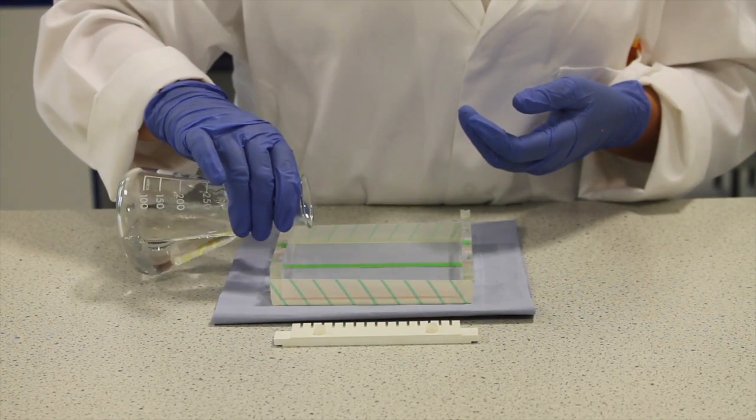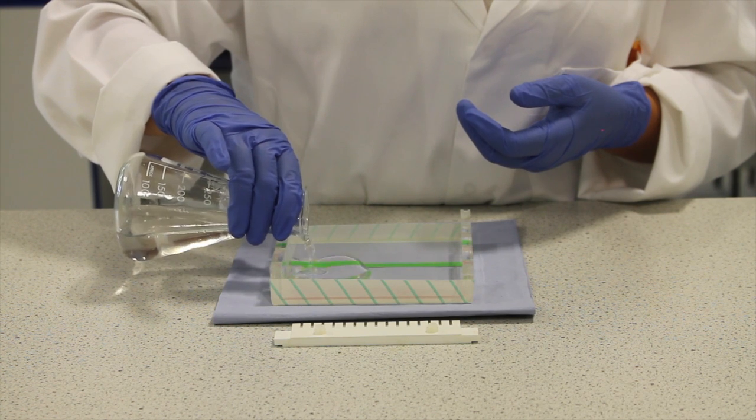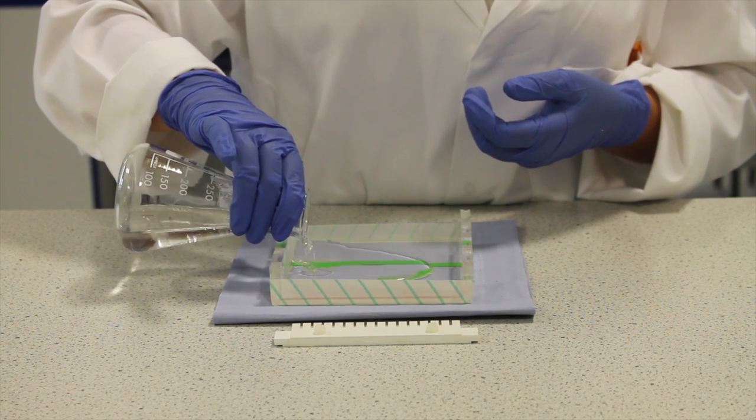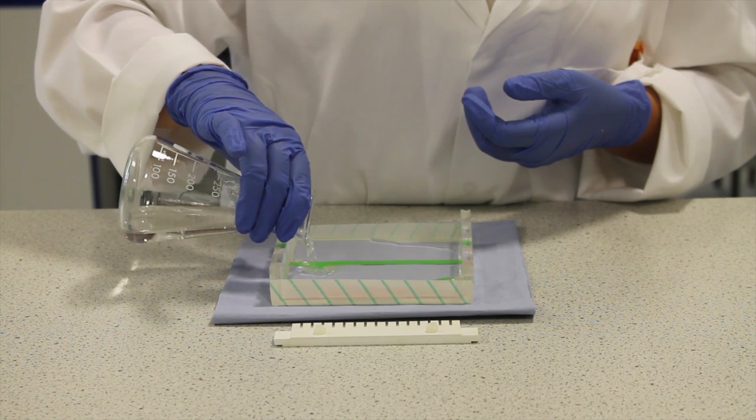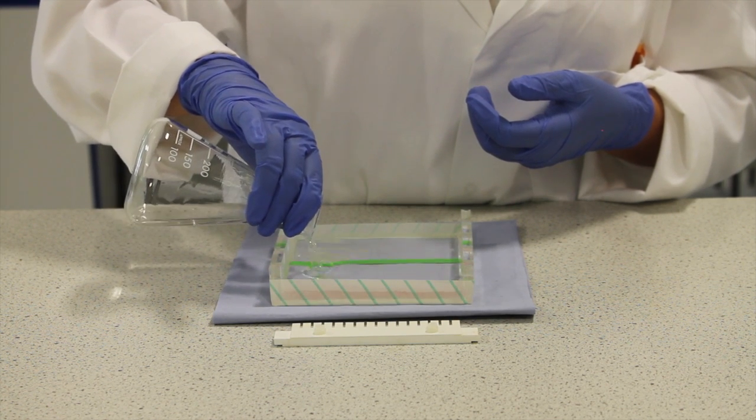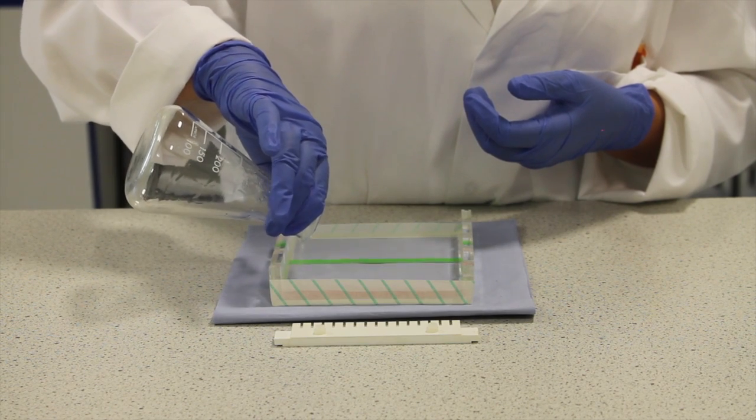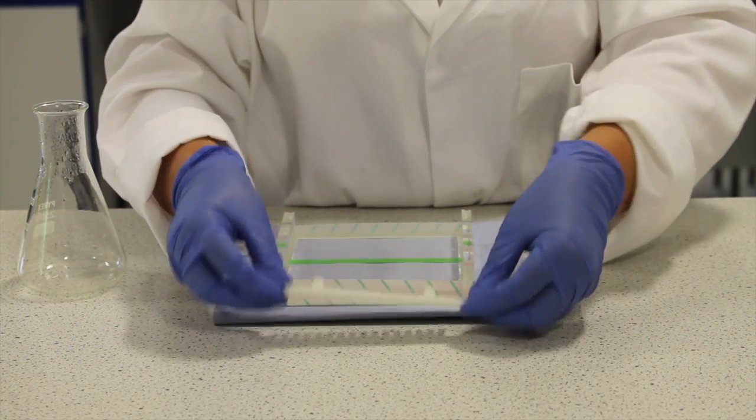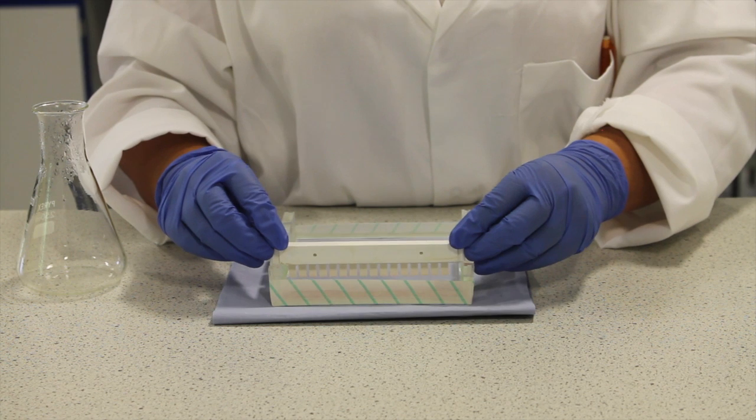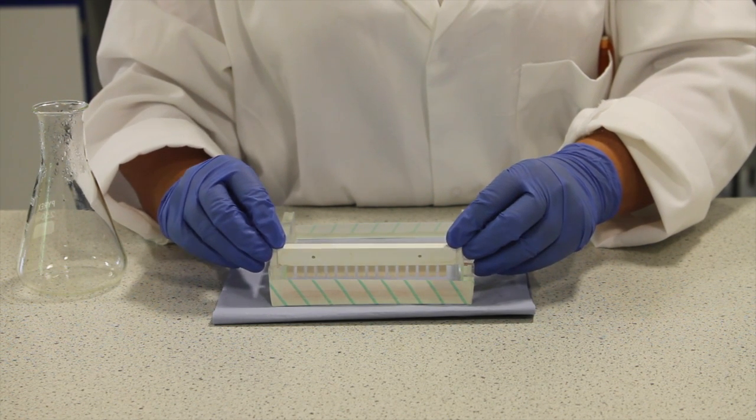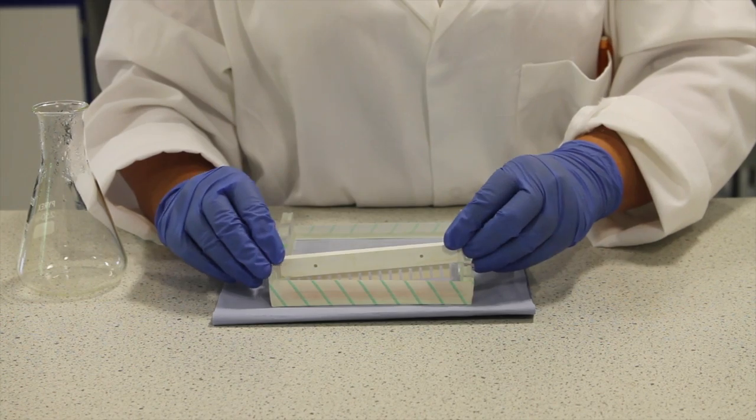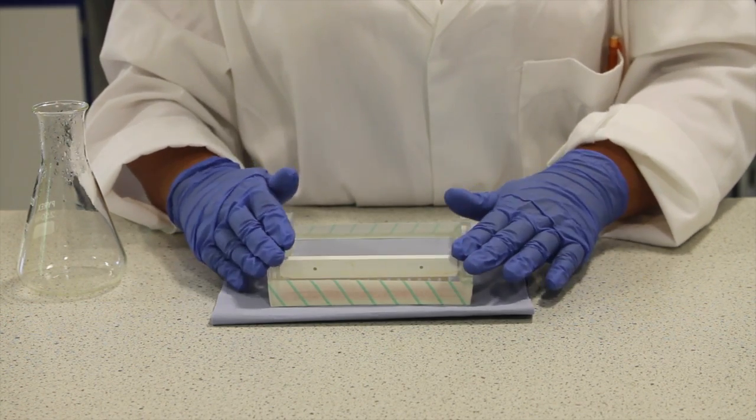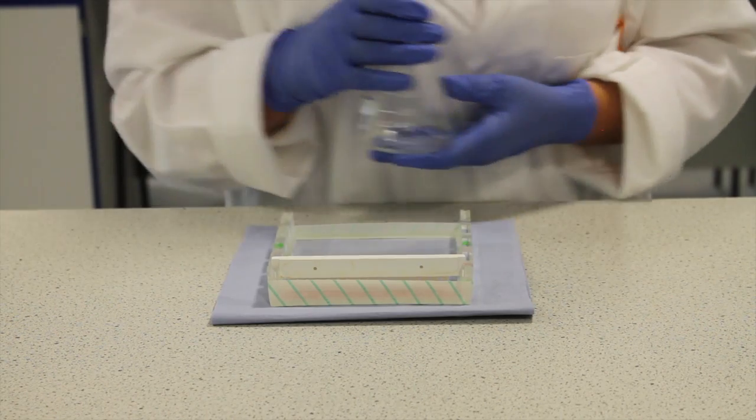When the gel is cool enough, carefully pour the solution into the casting stand. Do this slowly to avoid forming bubbles in the gel and also so that you can stop if the gel appears to be leaking from the stand. Once the gel is poured, a plastic comb is inserted into the gel. This comb will form wells into which the DNA can be loaded once the gel has hardened.